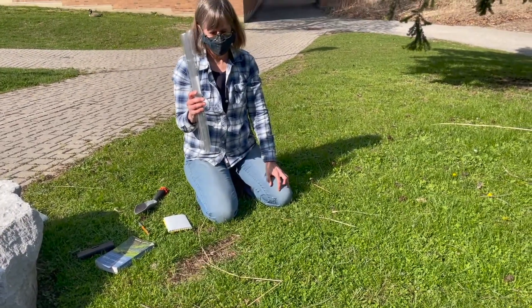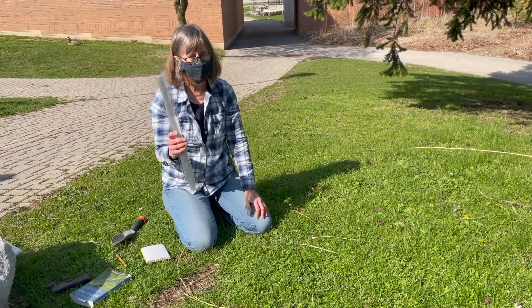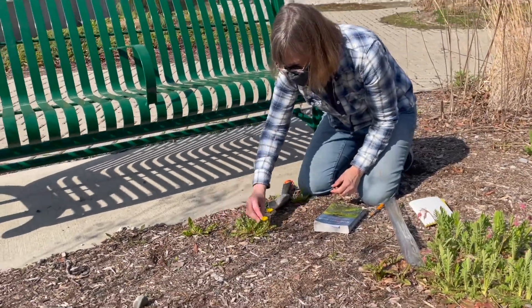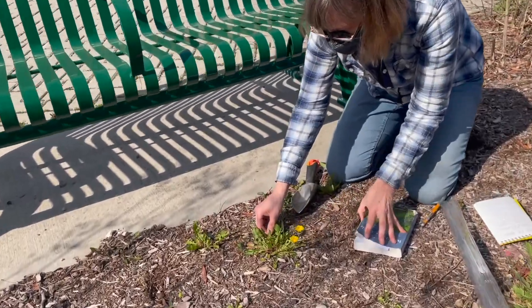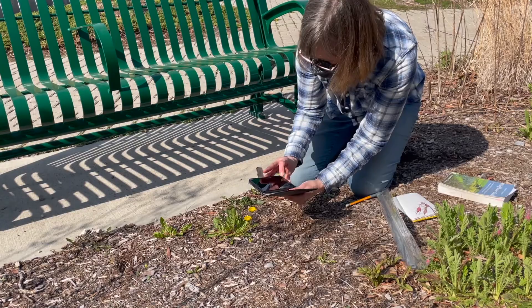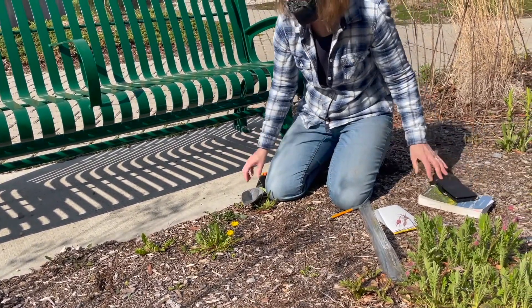Make sure the scroll is secured to prevent unrolling. If necessary you can use elastic or string to hold it securely. So now we'll move on to collect our second plant specimen. Again we will identify it using Newcomb's Wildflower Guide and then take some photos.